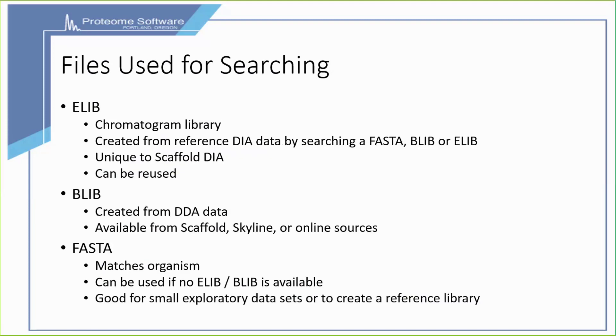Let's talk about some files for searching now that we've captured this data. There's an ELIB or chromatogram library, created from reference DIA data by searching a FASTA, a BiblioSpec library, or an existing library. This is unique to Scaffold DIA but can be reused.